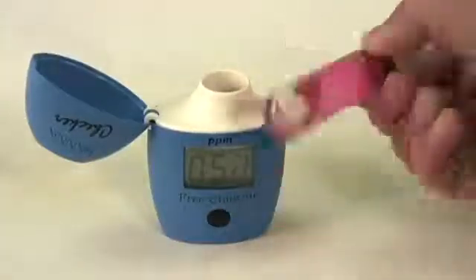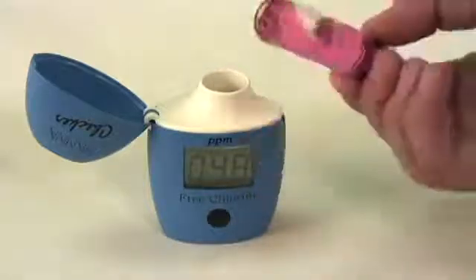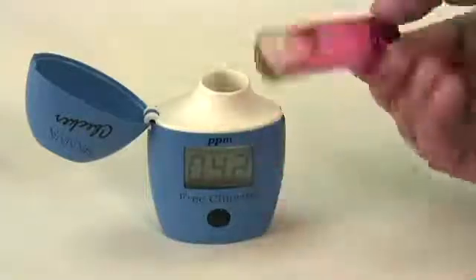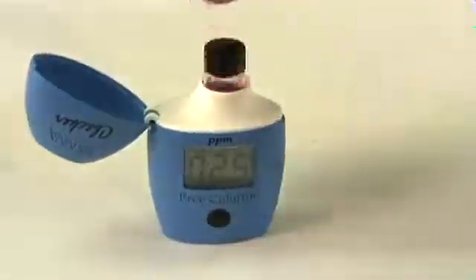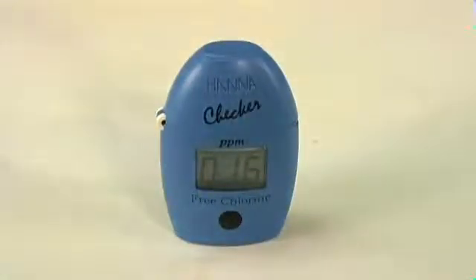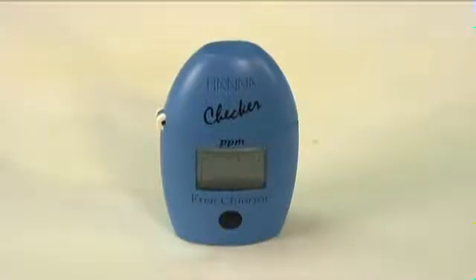You're going to want to mix your sample by inverting the cuvette rather than shaking it, to prevent air bubbles from distorting your measurement value. Again, you're going to wipe the cuvette down, insert it into the meter, and close the lid before the meter hits zero. When the Checker hits zero, it automatically begins the process of reading, so you have to make sure that the measurement is in there. Now it's going to take the measurement — you see the three dashed lines — and we get a free chlorine value of 1.93.